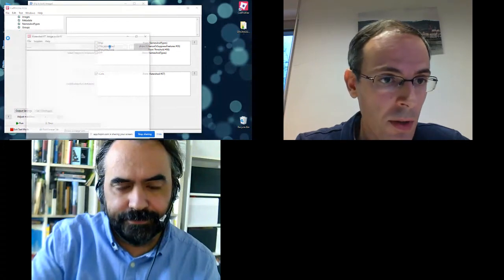So I will click on this button here, and let's actually do the measure. It's showing us some statistics about a bunch of measurements it has just done for each object. And if we were happy at this point, we can just go to file processing and export to spreadsheet.